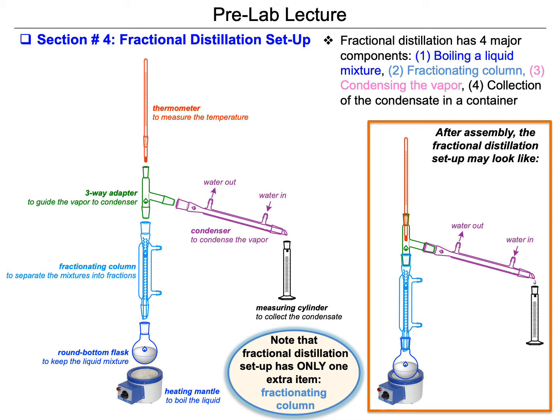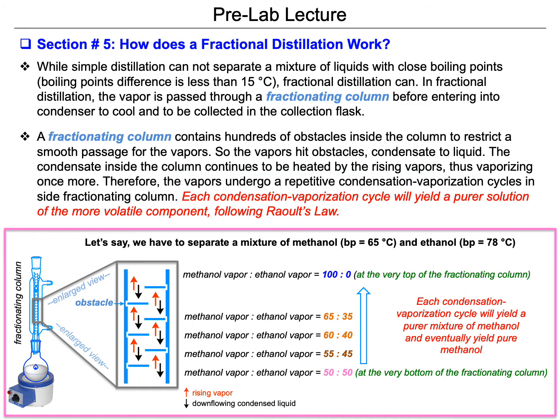In this slide, you see the fractional distillation. It has four components, one component extra compared to the simple. The extra, as you see, is the fractional column before the three-way adapter. And in this slide, we are explaining the mechanism of the fractional distillation.